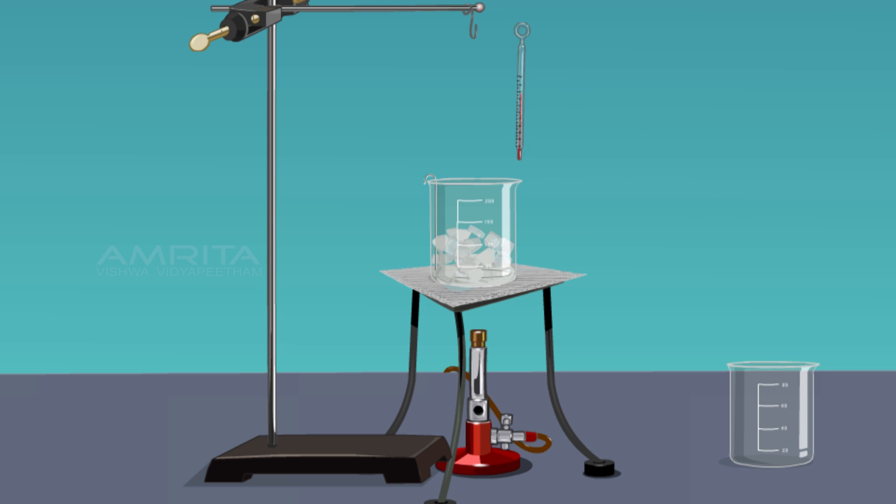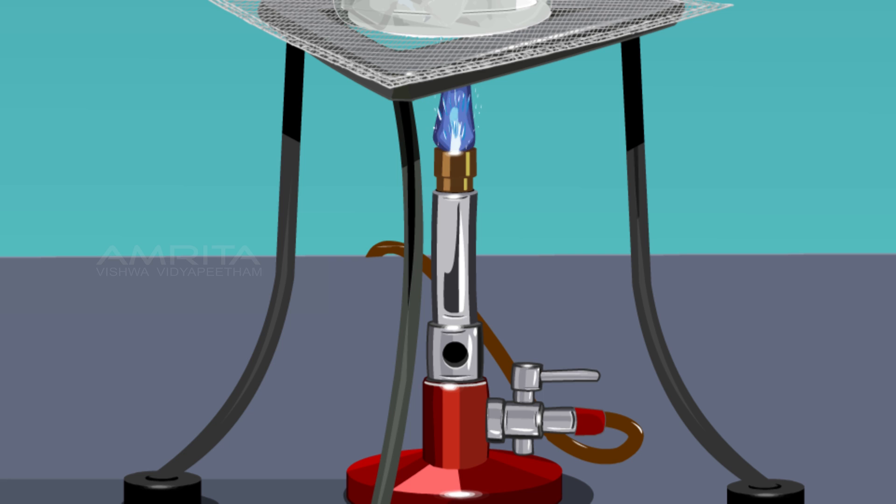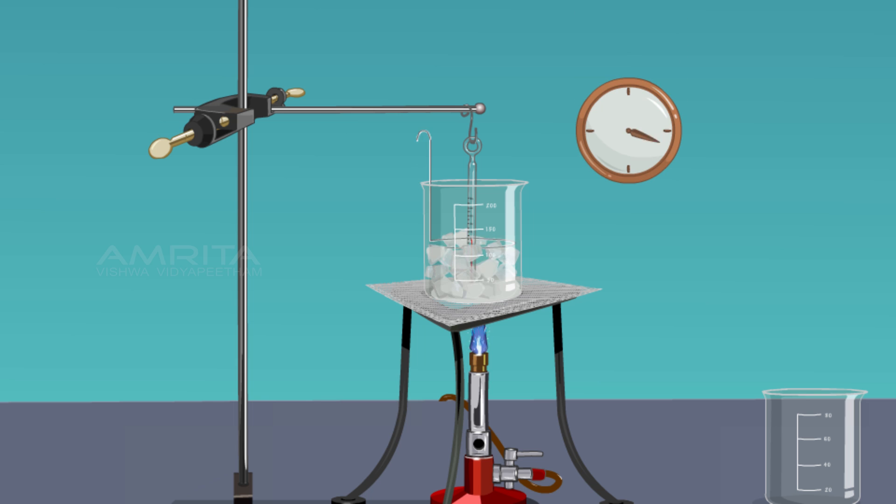Take a thermometer and suspend it with the help of a clamp stand so that its bulb remains in the middle of the ice cubes. Heat the ice cubes at a moderate temperature using a Bunsen burner and stir continuously to keep a uniform temperature throughout.